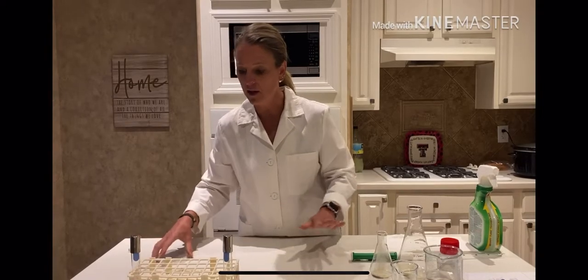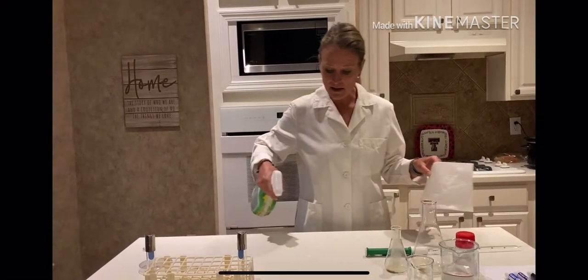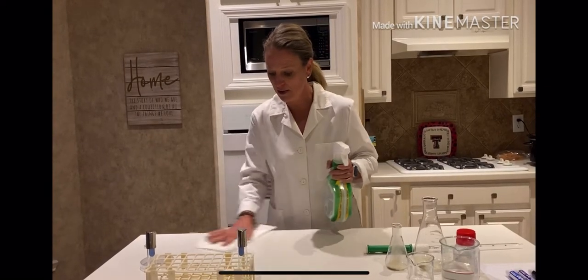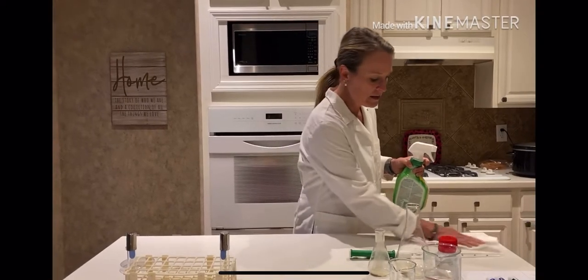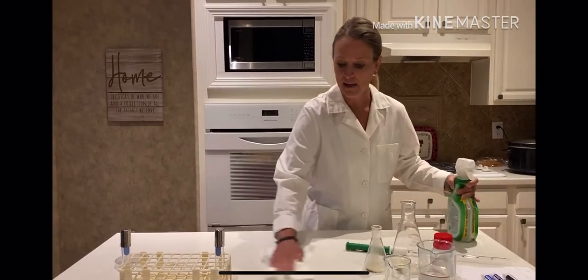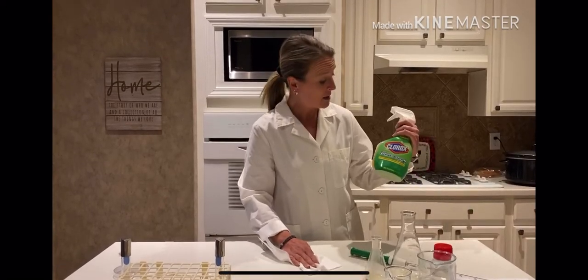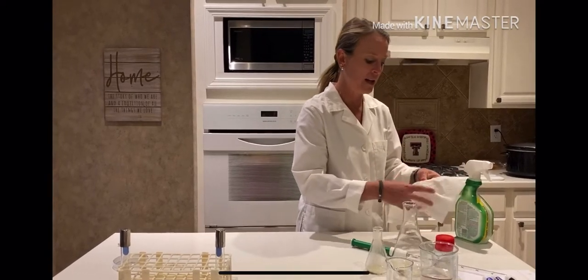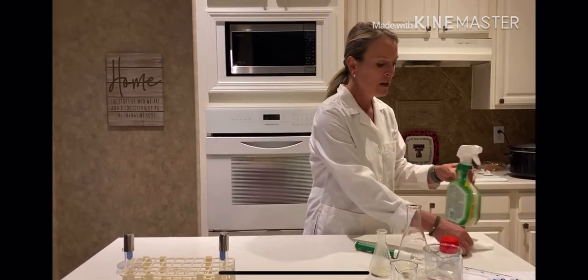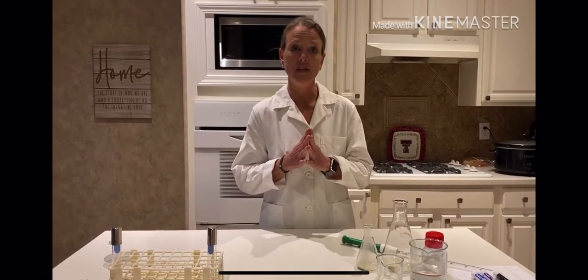I've got all of my stuff set out on my table and I'm going to go ahead and sterilize my lab bench as you would do in a lab situation. Once I have gotten my lab bench nice and clean — for this particular lab since I'm at home, I'm using Clorox bleach, but you would use whatever disinfectant you had in your lab. I've already washed my hands, so now I'm prepared to start my lab.